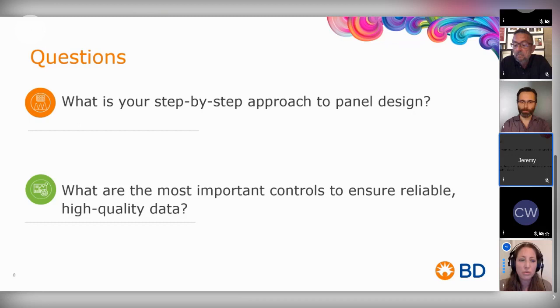But do elaborate FMO experiments where you leave out each reagent in subsequent samples to see if you have some spillover spreading that really affects detection of some of your antigens. Try some variations of the panel to see if you can optimize and improve detection of some of your weaker expressed antigens, etc. And then finally, you want to validate the panel.